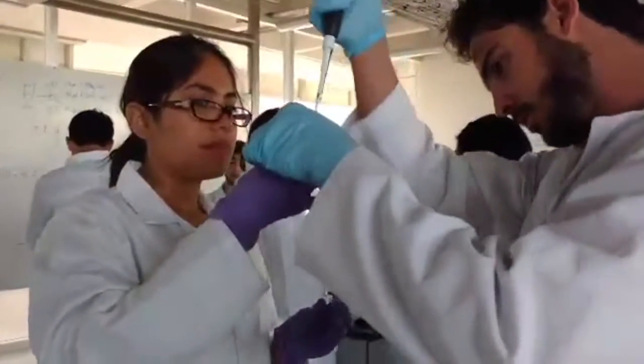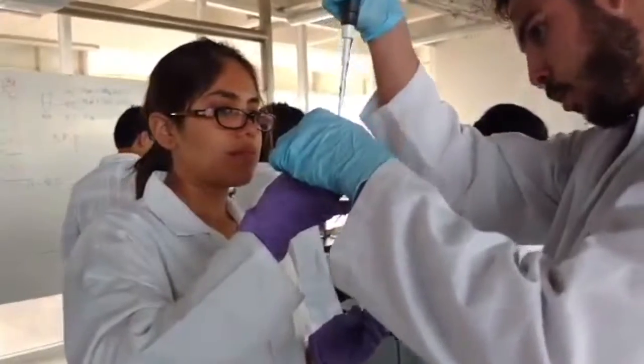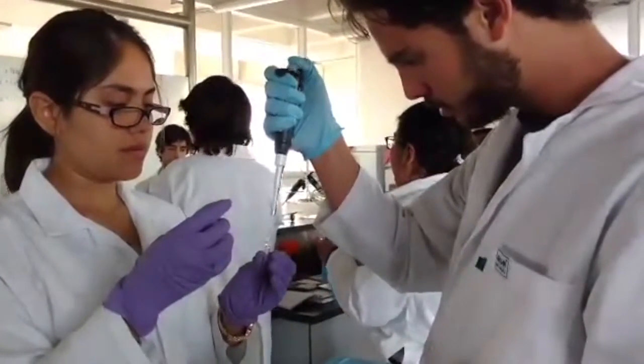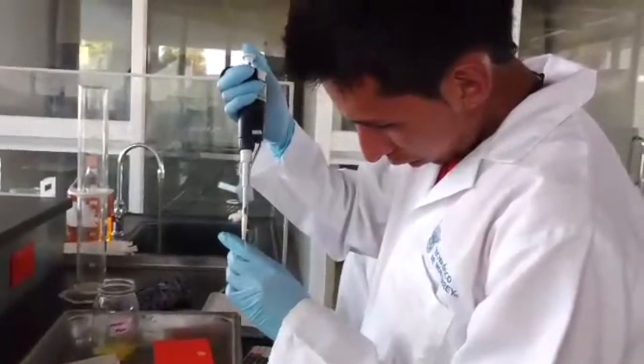When performing a PCR, it is important to consider the following. Reagents, purity, and avoiding contamination. It is good practice to aliquot all reagents used for PCR into multiple tubes so that a fresh set of reagents may be used for each experiment. Also, good lab technique and wearing gloves is crucial for the success of PCR.